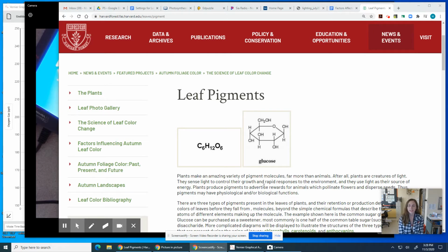Today we're going to be running one of the experimental conditions for our photosynthesis lab, where we are designing a Biosphere 3. So seeing if we can get a Biosphere 3 to run successfully on Mars. And our guiding question for this activity: how will you maximize photosynthesis in Biosphere 3 to ensure that the astronauts do not run out of food or oxygen?